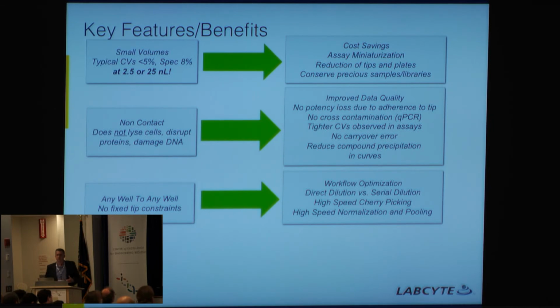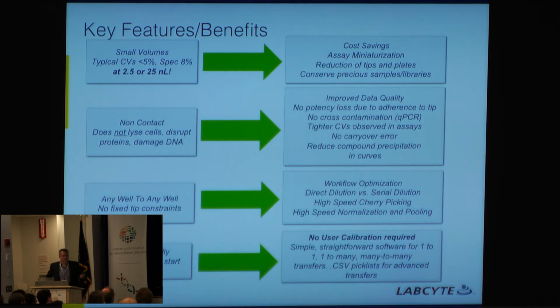And most importantly, even though the Echo is used on expensive automated high throughput platforms, DNA foundries, I think it's fairly end user friendly, and I think I can teach the average person to set up an Echo transfer and drag and drop their liquids around in about 30 to 40 minutes.